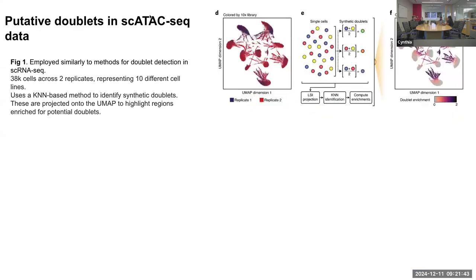This is a relevant point that they highlight. That is how they propose, integrated inside of the tool, a step to identify doublets in single cell ATAC-seq data, which is not common in the tools, but can also be done using different or external tools with other packages.